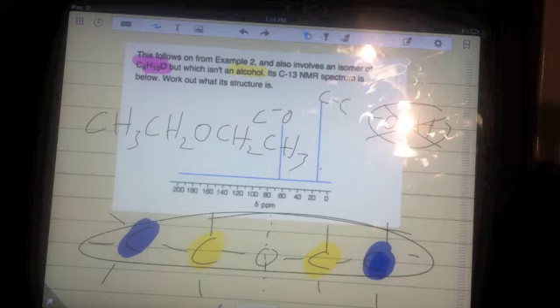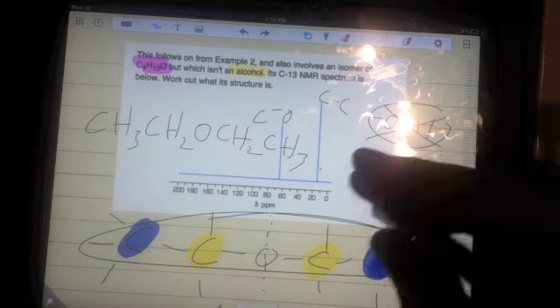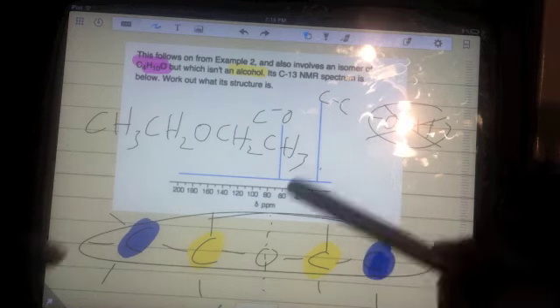And that's what I'm going to get onto now. If you have any questions on this, give us an email, give us a yell, but hopefully what you'll understand is it's just a matter of writing down what information you have and piecing it together to make sure it makes sense with the spectrum that you have.